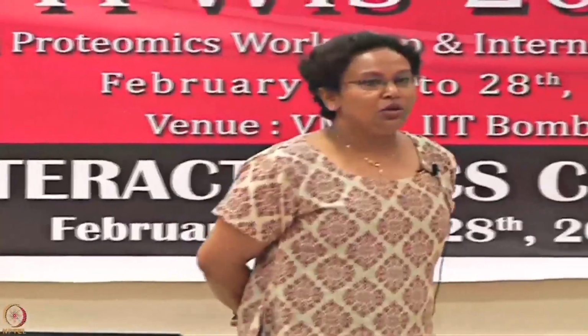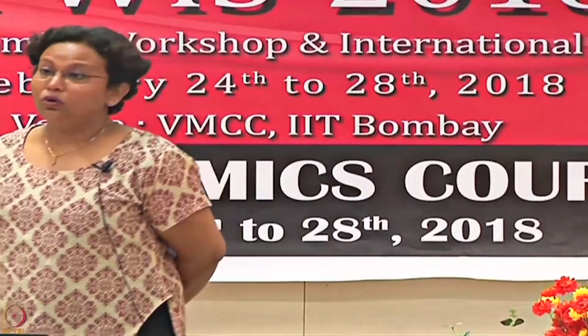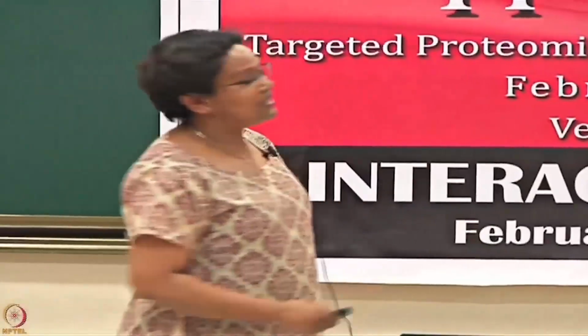So, post that I would like to talk a little bit about the assay development part. When you are ready to start your Biacore experiments, what are the things that you would like to take care of, when you have two interactants and you would like to see the interactions? What are the things that you would like to optimize, which one should go as a ligand, which one should go as an analyte, various other things, what the reference surface would be like, things like that. So, let us start. This is the basic assay development.